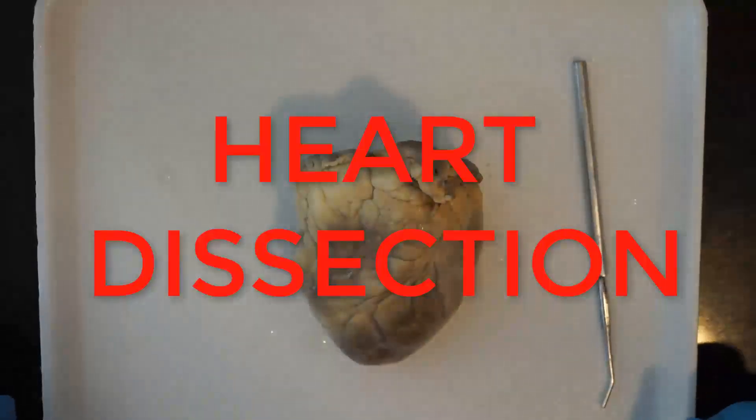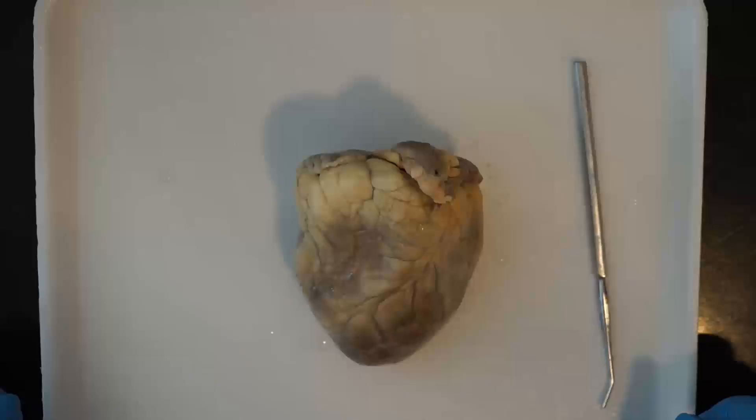Welcome to the heart dissection. Today you'll need a sheep heart and your dissection tools.